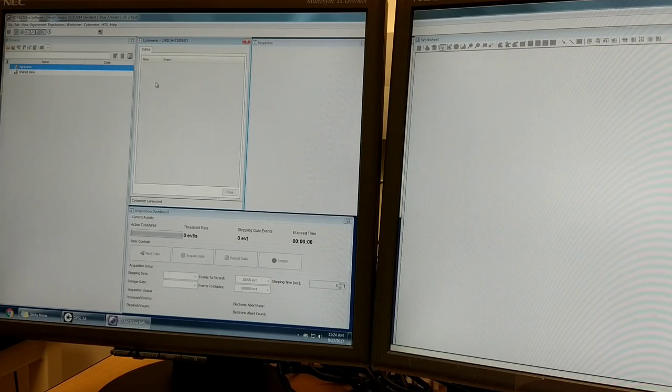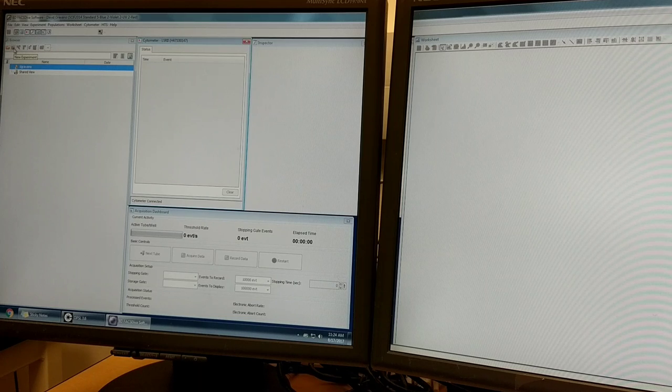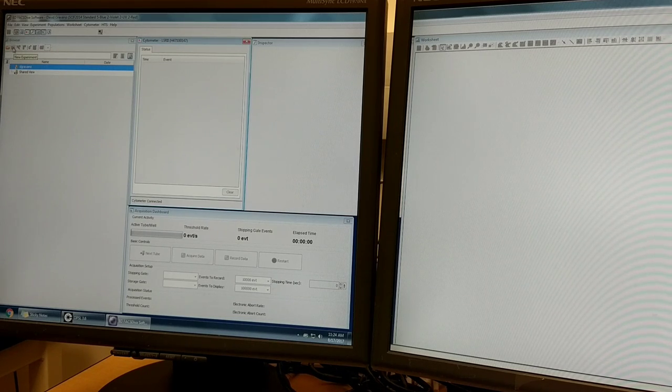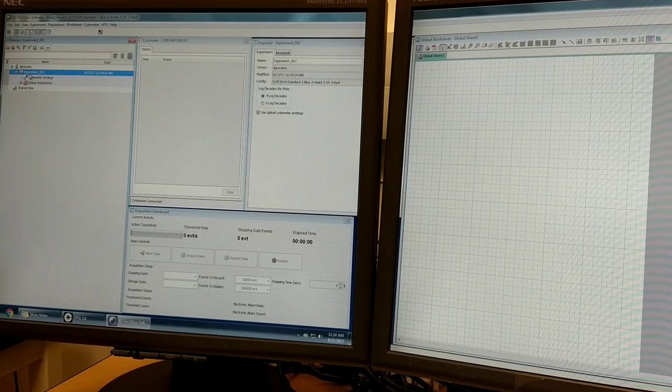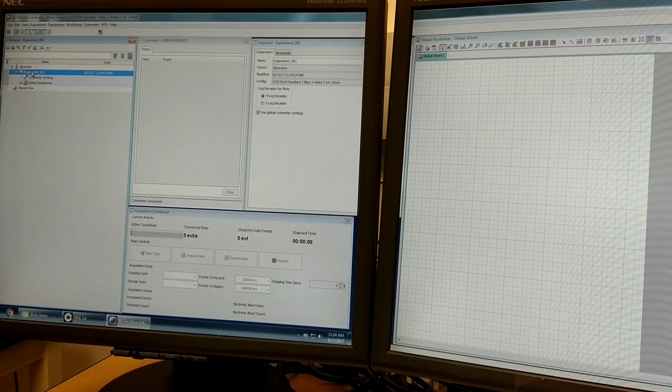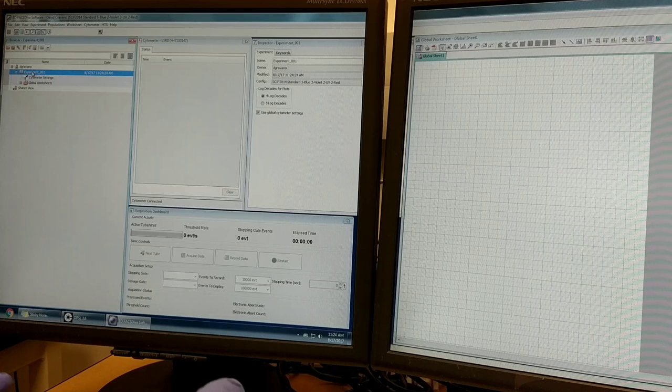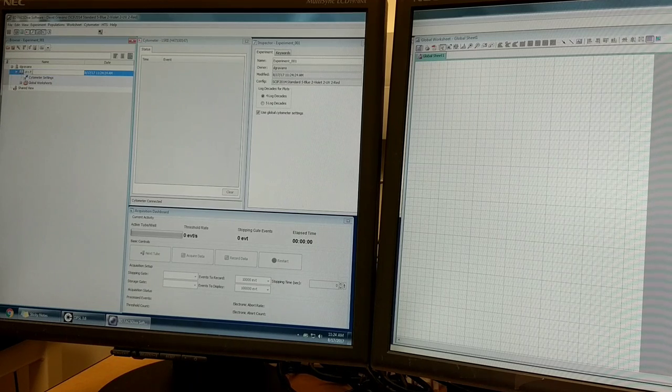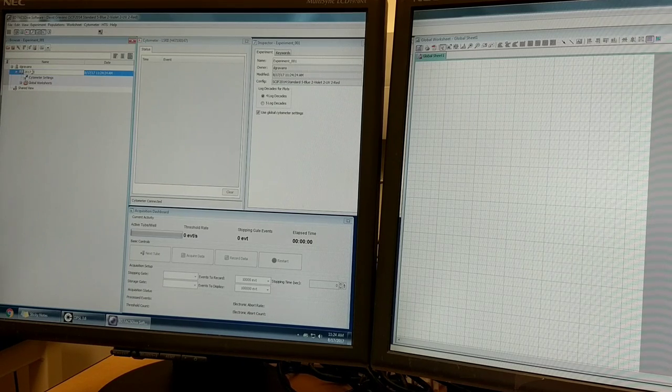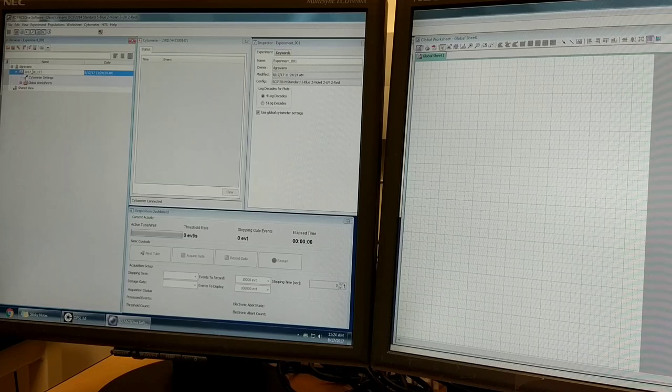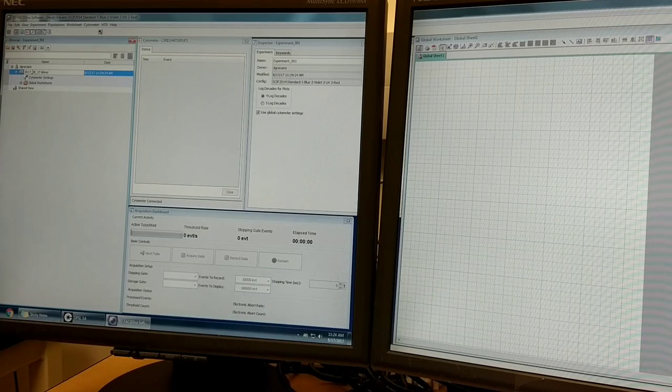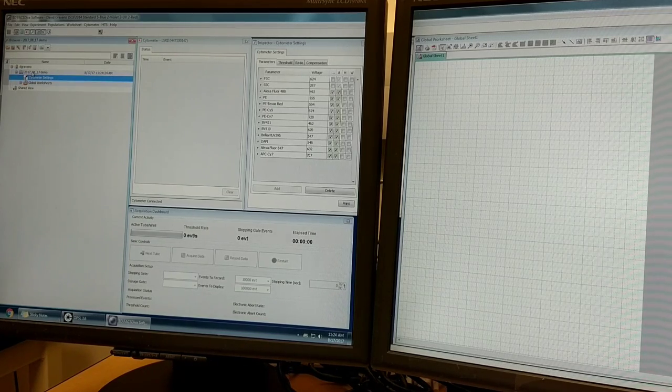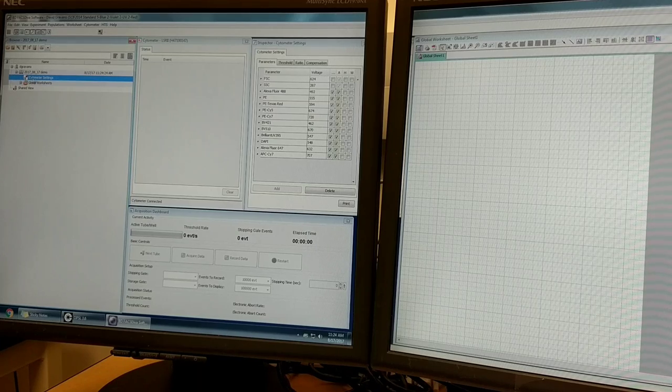The first step to starting an experiment is to create a new experiment. You can mouse over this icon that looks like a notebook in the browser and click on it. I always recommend naming your experiment with the year, month, and day convention for ease of organizing your files.